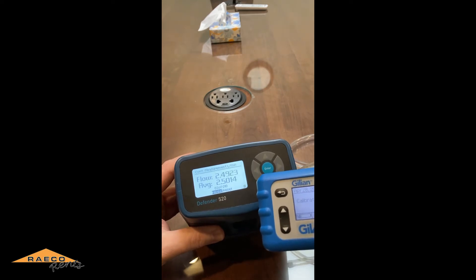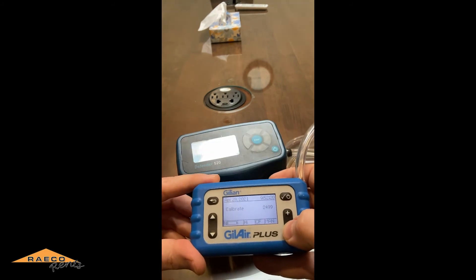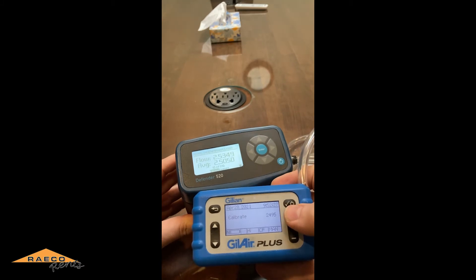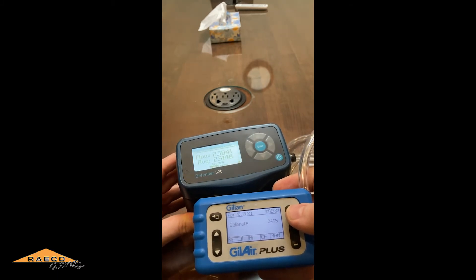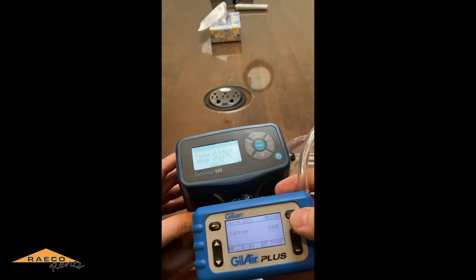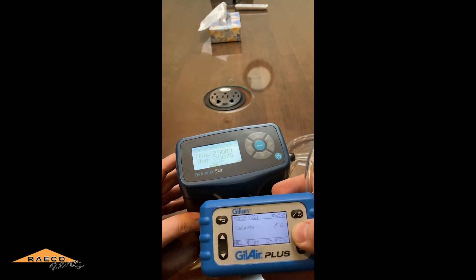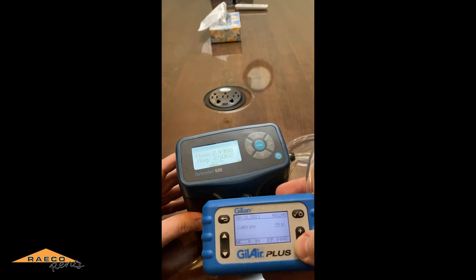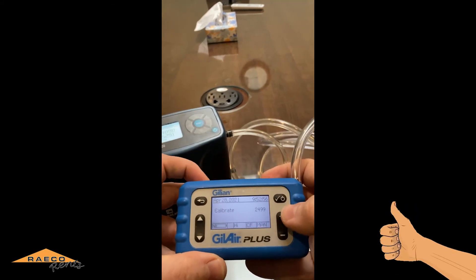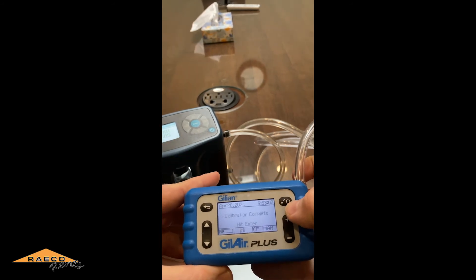Now we're reading pretty much right where we want. Once you get to the point you want, you can make another small adjustment — like to 2495 if needed. This shows you why you want to get an average over time, because the pump won't be exactly the same for each measurement. You may need to adjust again if it's a little too high; 2.506 is pretty good. Once you're happy with the calibration, hit the checkmark and your calibration is complete.